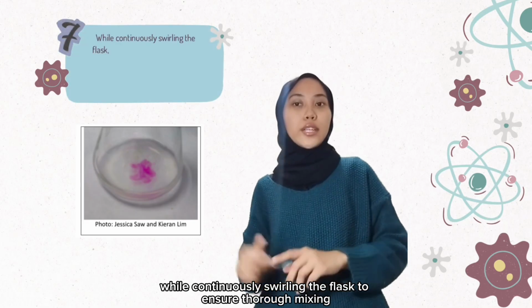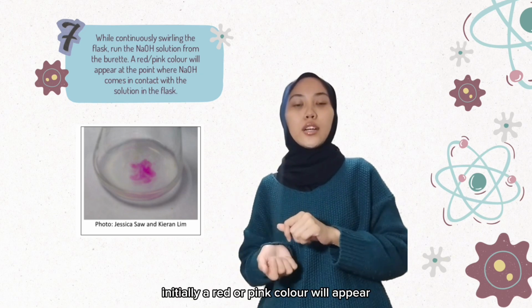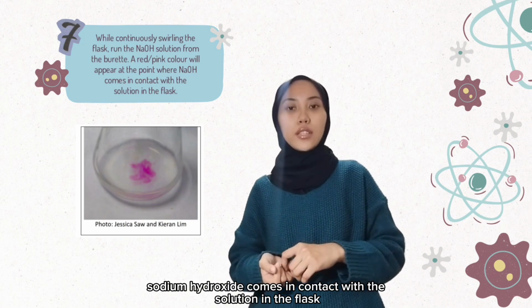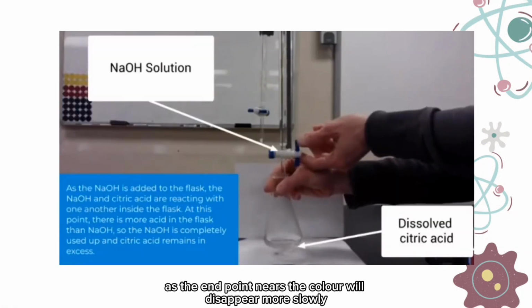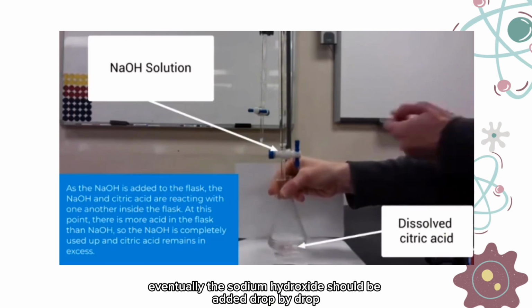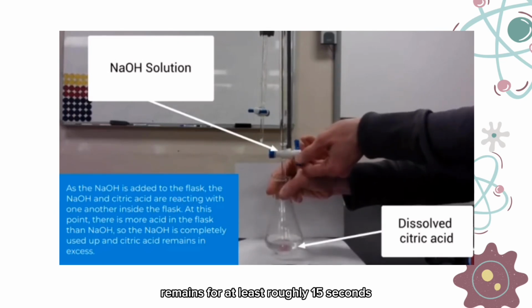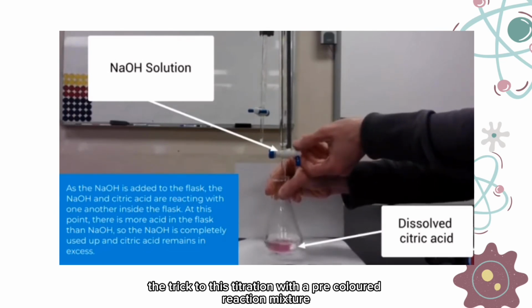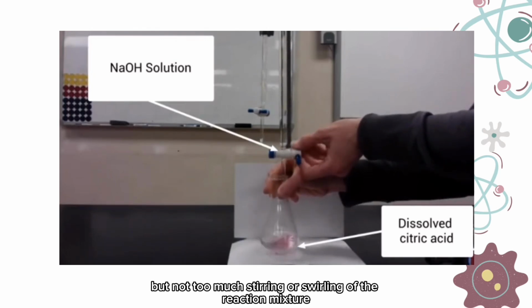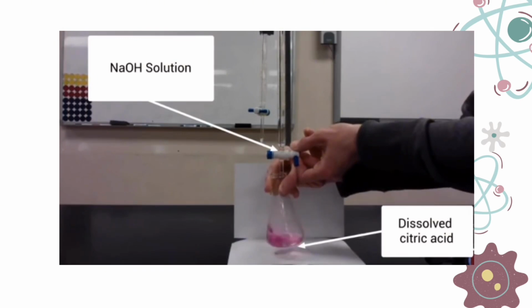While continuously swirling the flask to ensure thorough mixing, run the sodium hydroxide solution from the burette. Initially, a red or pink color will appear at the point where sodium hydroxide comes in contact with the solution in the flask. As the endpoint nears, the color will disappear more slowly. Eventually, the sodium hydroxide should be added drop by drop until the red or pink color caused by 1 drop of sodium hydroxide remains for at least roughly 15 seconds. The trick to this titration with a pre-colored reaction mixture is to have some but not too much stirring or swirling of the reaction mixture.